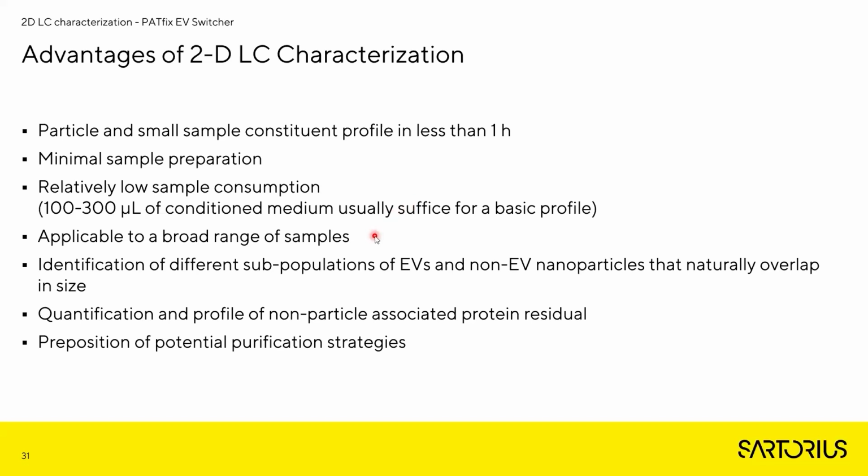The approach is applicable to a very broad range of samples, and it allows us to identify different subpopulations of EVs and non-EV nanoparticles that would naturally overlap in size. It would also allow us to quantify and profile non-particle associated macromolecule residuals, and we would also already get some information for potential further purification stages.